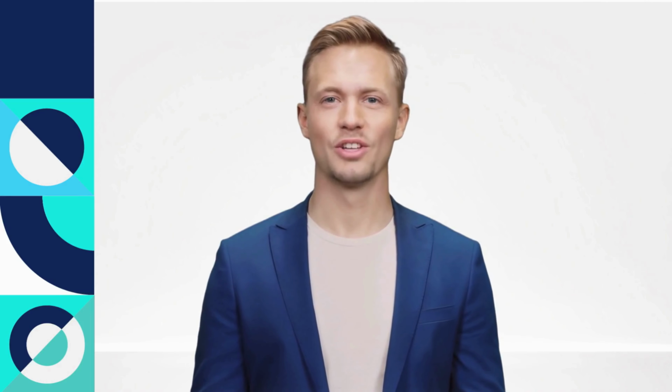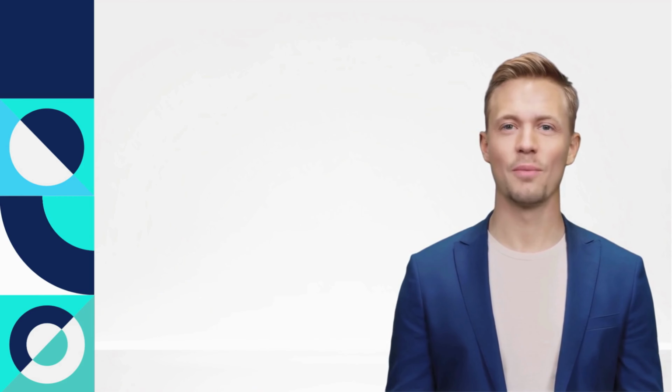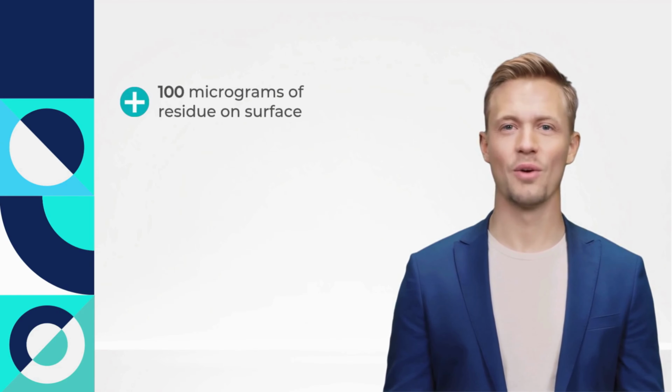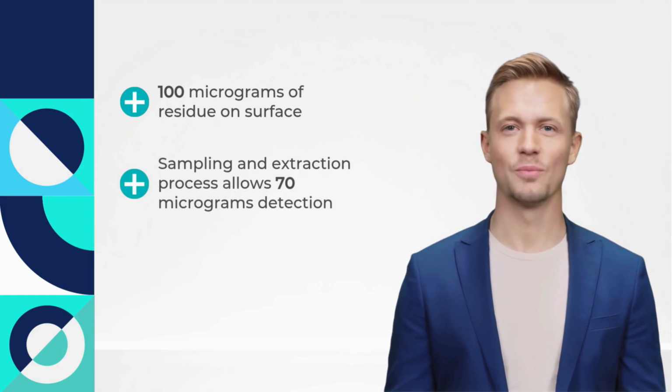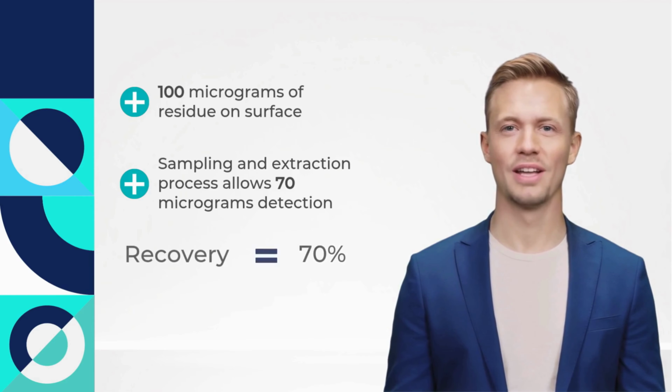When cleaning results are interpreted, one of the most important questions is how much of the residue on a surface is actually captured by the sampling process. This is described as recovery. Recovery is the percentage of residue that can be removed from a surface during sampling and then detected by the analytical method. For example, if 100 micrograms of residue are present on a surface and the sampling and extraction process allows 70 micrograms to be detected, the recovery is 70%.